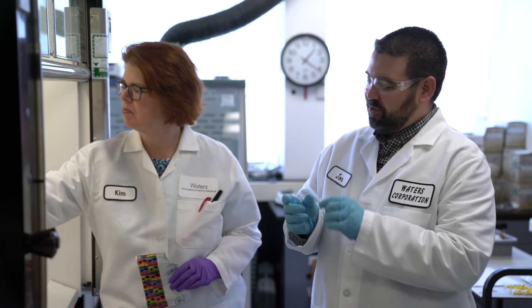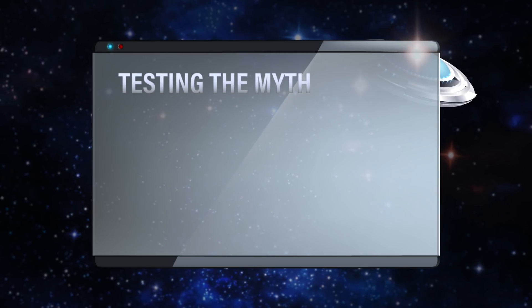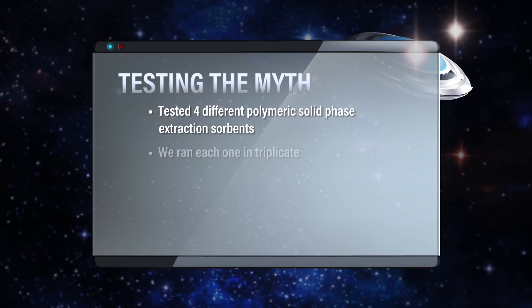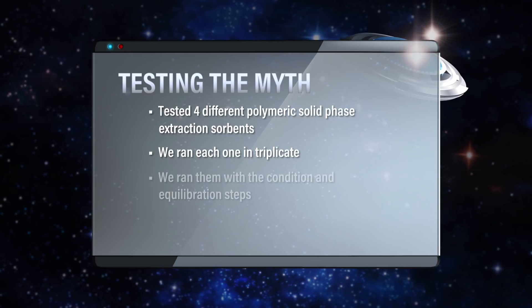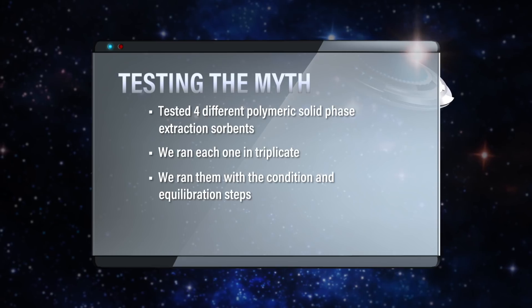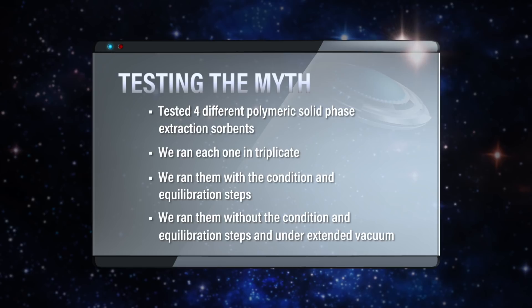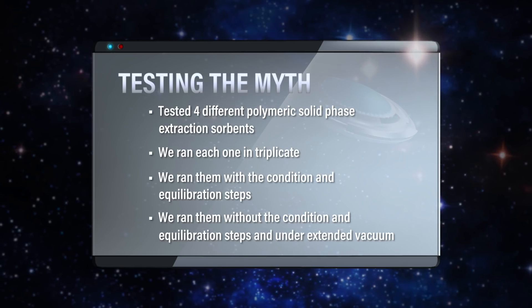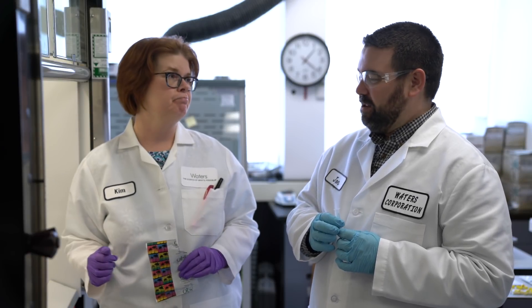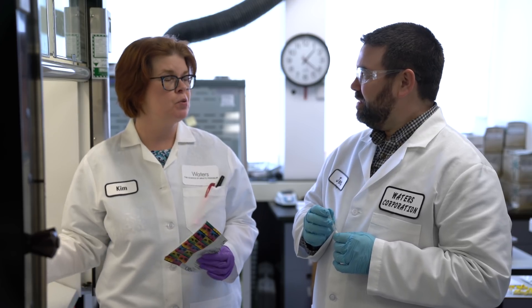Let's recap what we did with these little 1cc cartridges. We tested four different polymeric solid phase extraction sorbents to see if they were water wettable. We ran each one in triplicate — with the conditioning and equilibration steps to properly wet the sorbent first, then in a separate experiment without those steps, and also under extended vacuum to see to what degree those solid phase extraction sorbents would de-wet. From the data, we should be able to tell whether the sorbent is truly water wettable, even though it's polymeric.